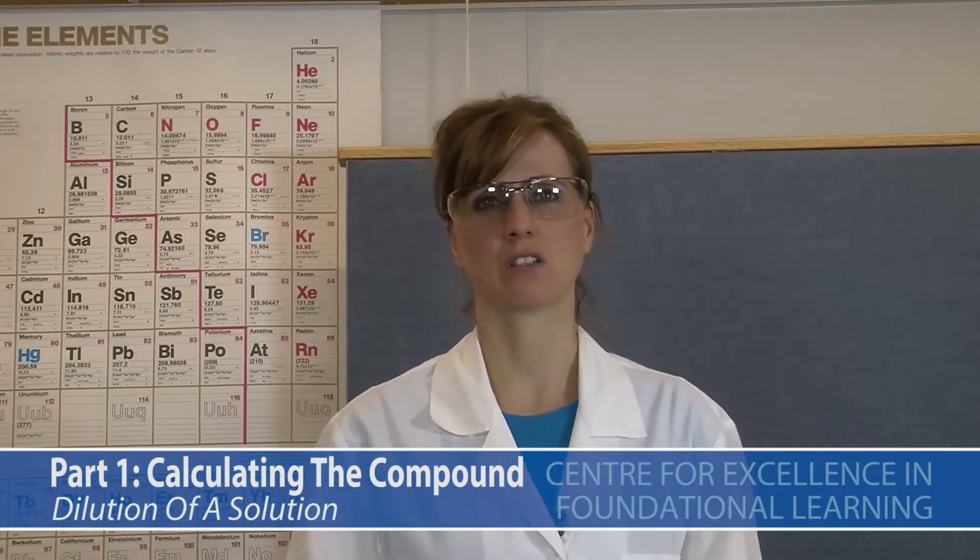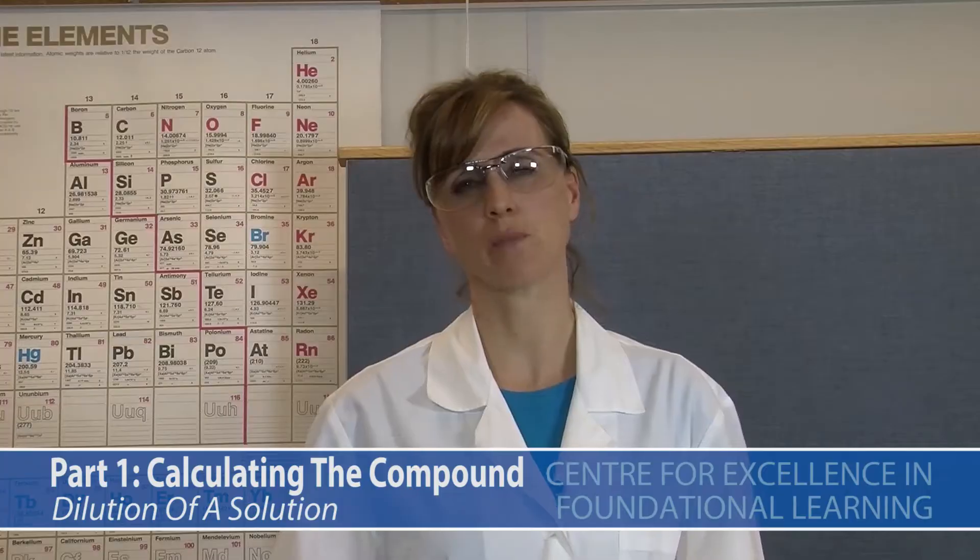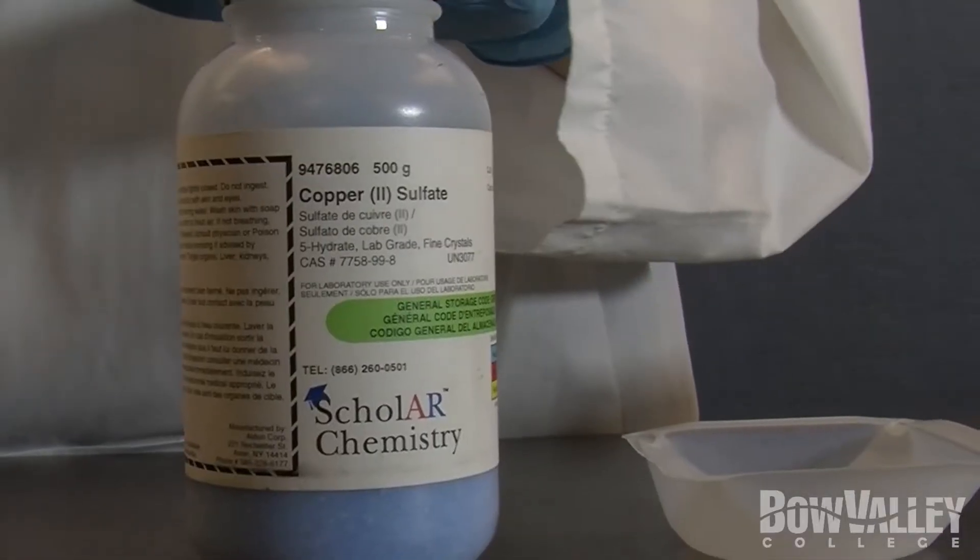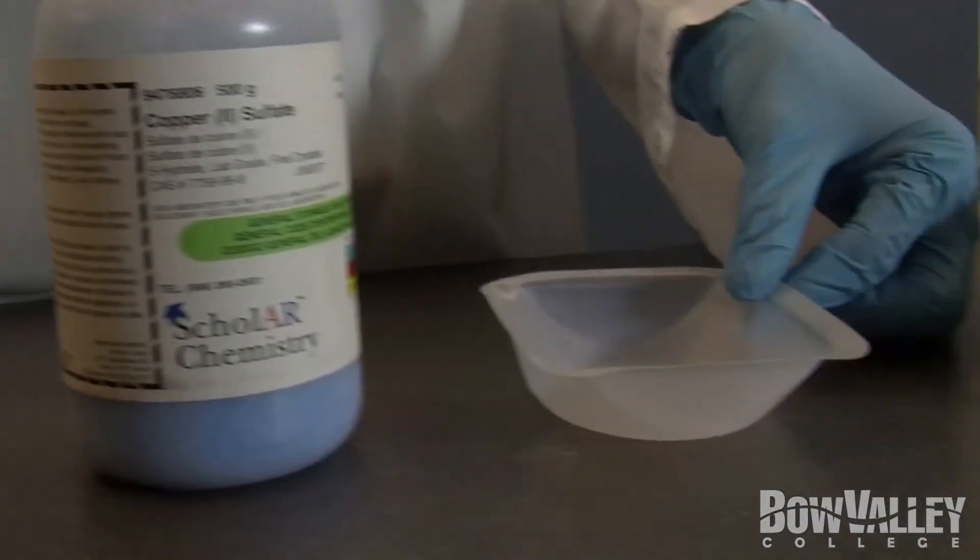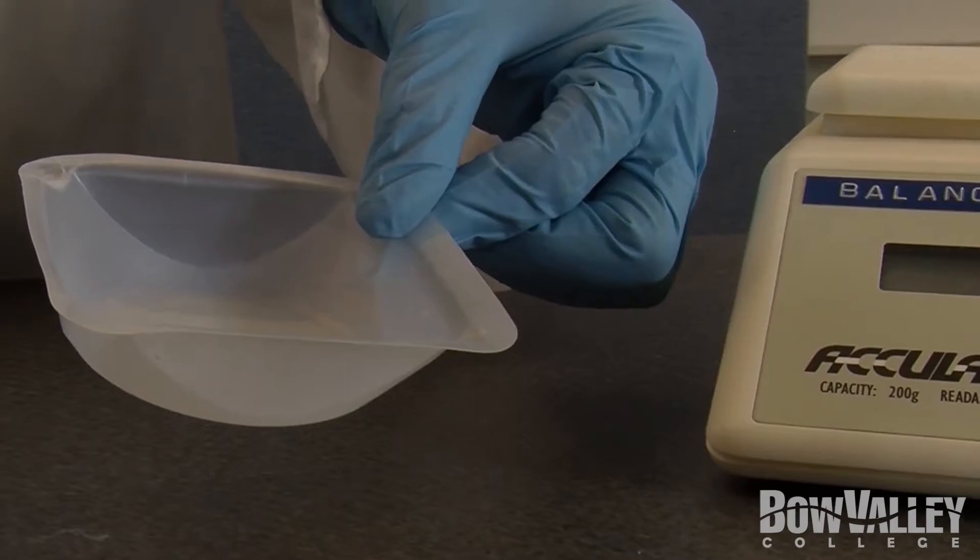We need to calculate how much copper(II) sulfate pentahydrate is needed to make the solution. I've done the calculation already and we need 6.2 grams. These are the things we're going to use: copper(II) sulfate pentahydrate, a scoopula, weighing dish and a scale.